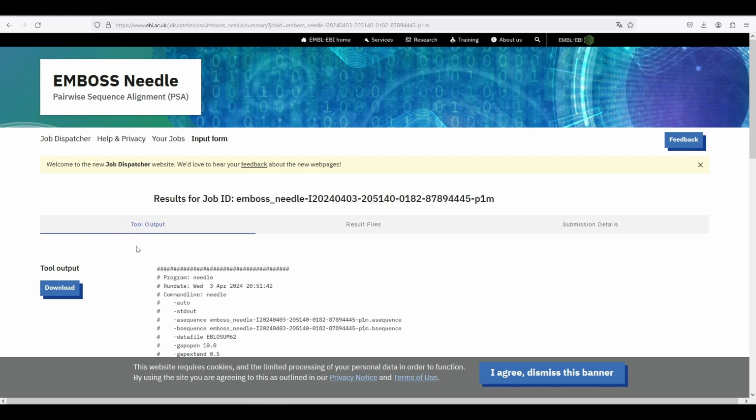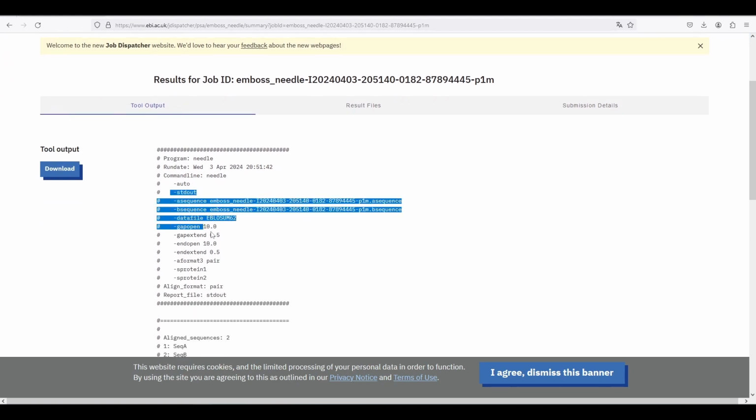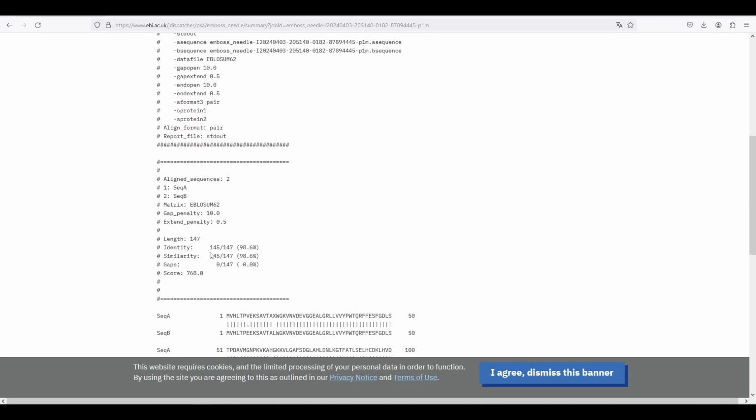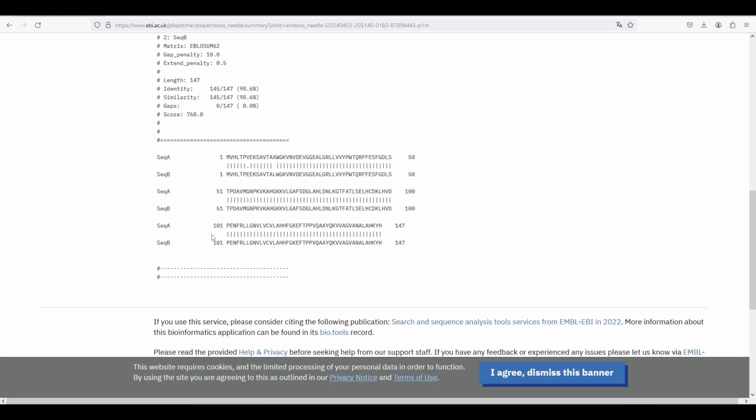After getting the results, we can review our settings once again. Then we get a summary on our results, so apparently there should be 2 mismatches and no gaps. If we go further, we can take a look at our alignment and we see that the divergence is displayed within the first few residues.